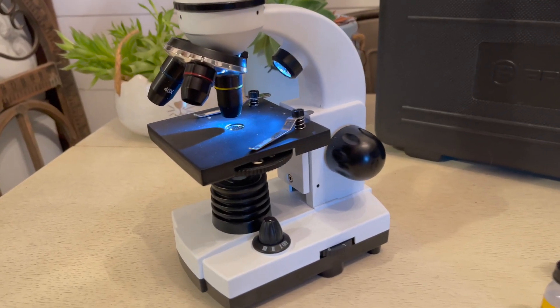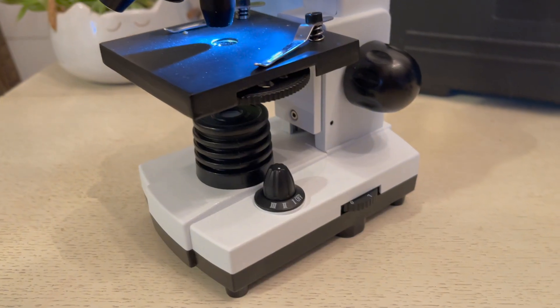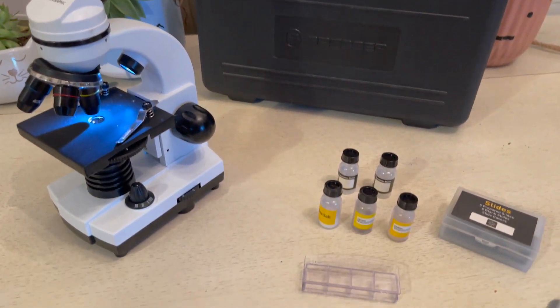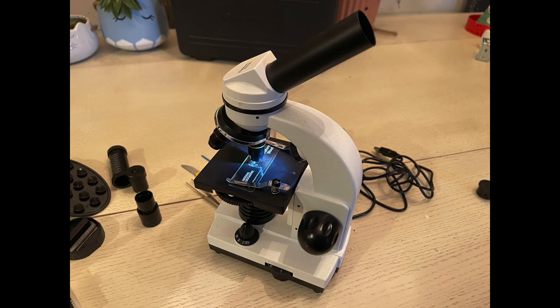It's a very sturdy microscope so it's not easy to knock over. There are multiple different features including a color dial to change the color of the light underneath the slide. The clips will hold the slide in securely.